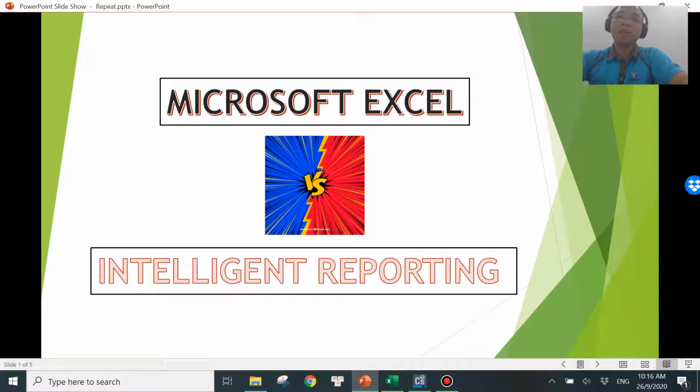In this video, we'll be talking about repeatability, how to calculate it using Excel and intelligent reporting.